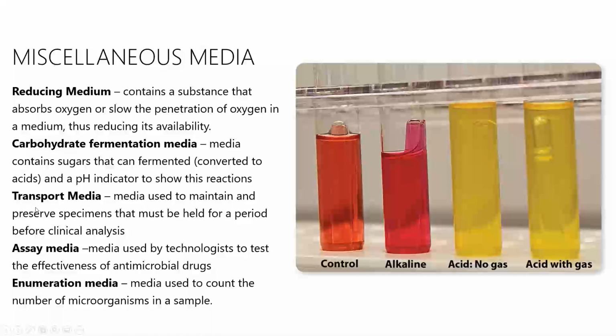We also have transport media. This is media used to preserve specimens. So maybe you take a patient sample at the clinic and you take their blood sample or a stool sample, something like that. And your clinic doesn't have a lab on hand. You have to go across town. So you'd put it in the media to kind of freeze it in time to preserve it. And then you can run it across town, bring it to the lab, and it still has all the microorganisms intact.